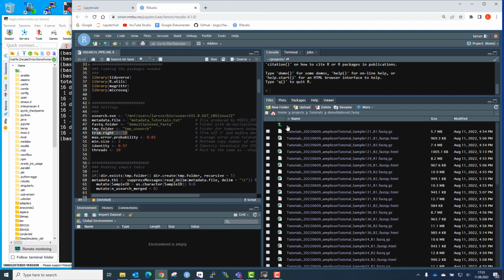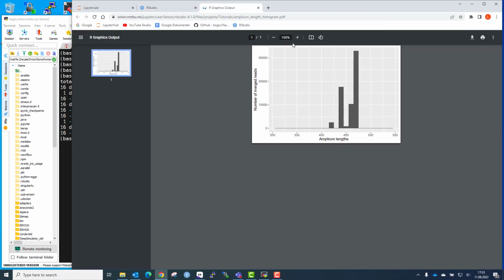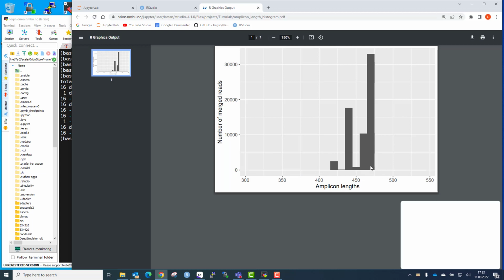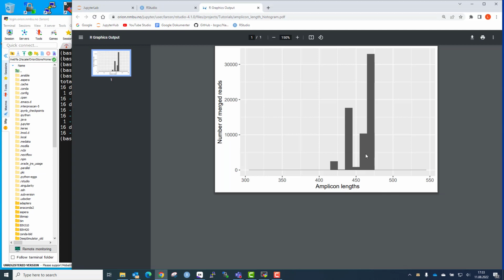And also remember, if I go back here, the amplicons we saw are typically like 450, at least 400 or close to. So it means that the two reads, each being 300 bases long, if you merge them and together they become this long, it means that they must overlap with at least 150 bases or something along that line.